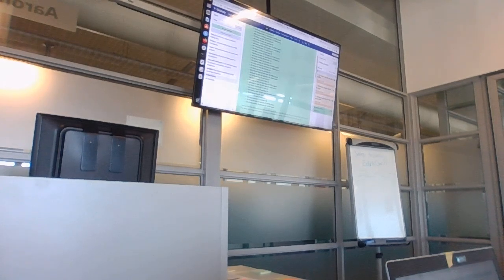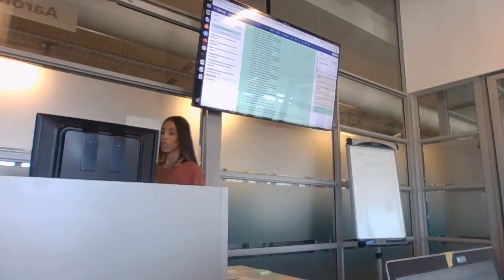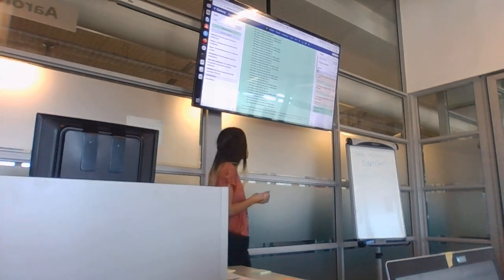I see a lot of you still have the box clicked. You can untick that blue box, so you can see a box here next to it as if you're going to select files, but you don't want to, so you can just click on this so that that option is gone if you don't like it.